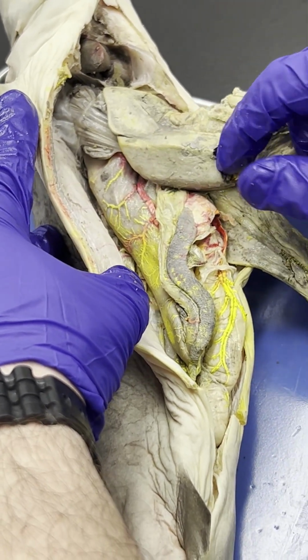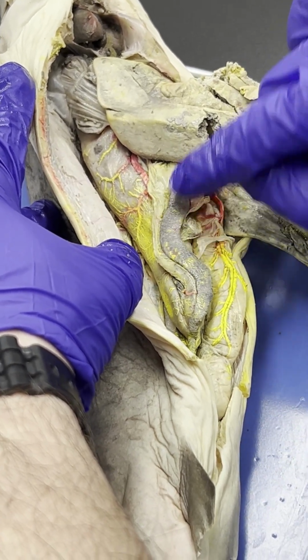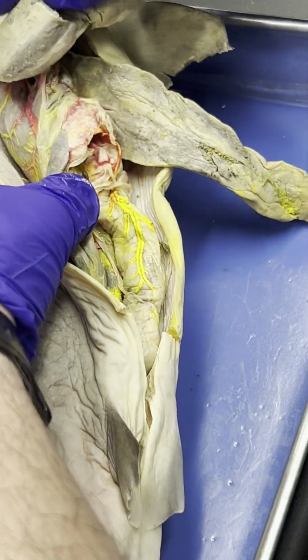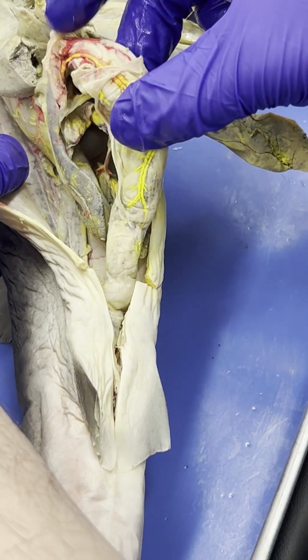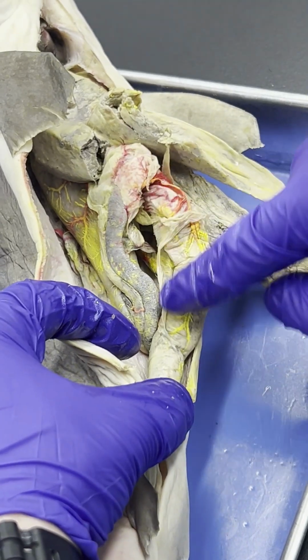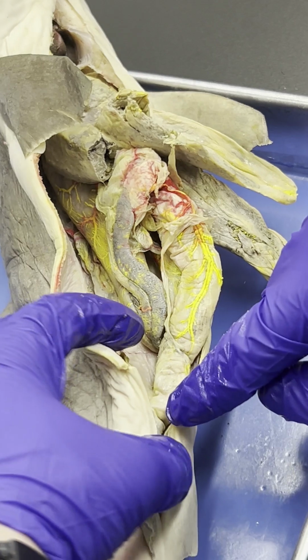We talked about the pancreas. So here we actually have the dorsal pancreas and the ventral pancreas. And then bolus after the stomach, after the pylorus, we'll get into the duodenum, which is right here. Then we have the valvular intestines, which is right here, with the spiral valves inside of them, colon, and then cloaca.